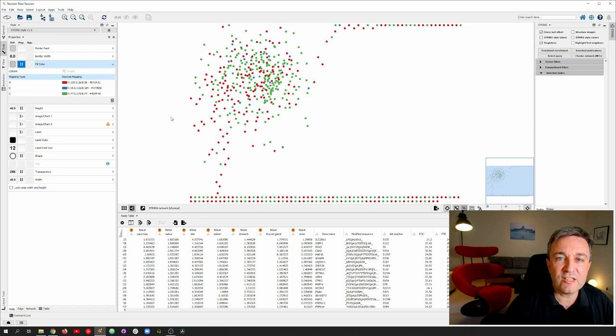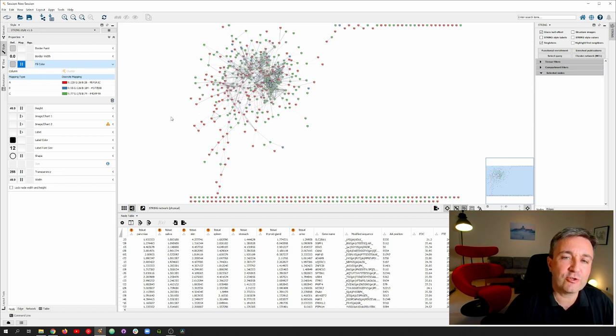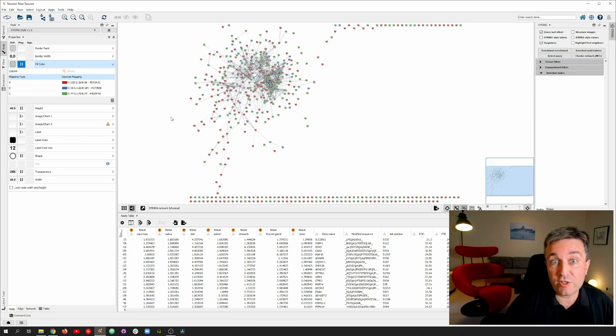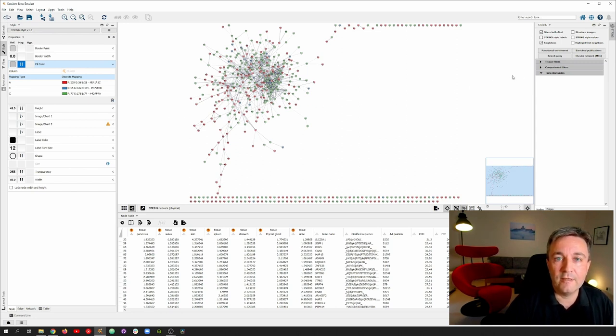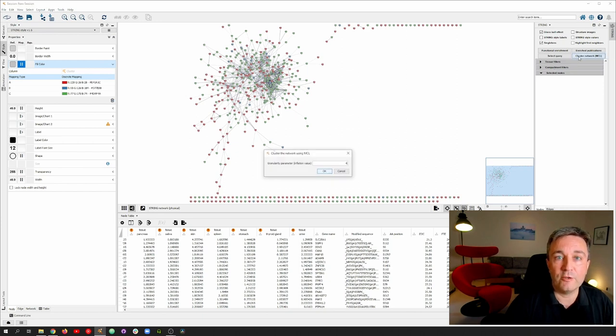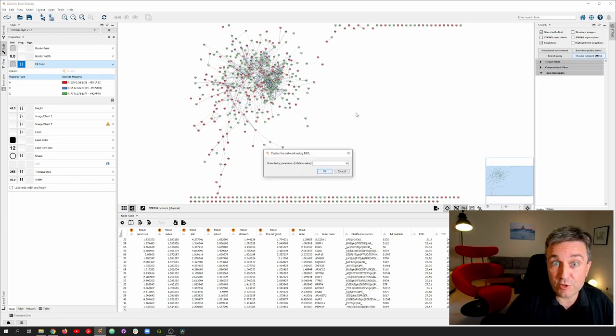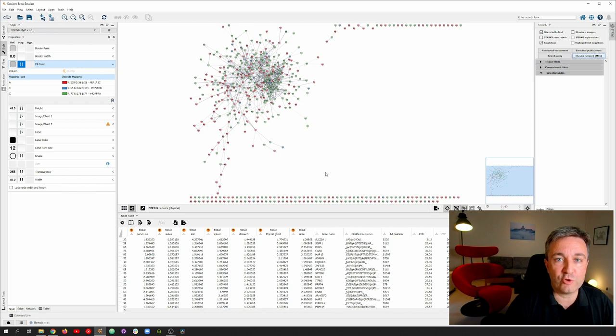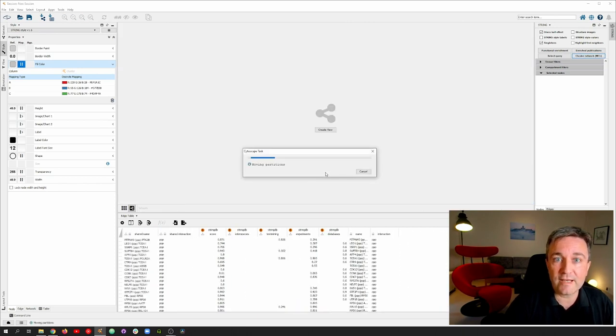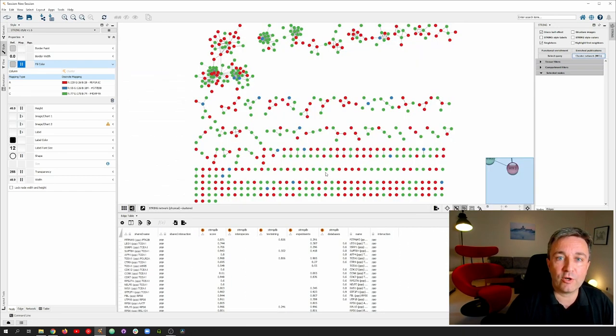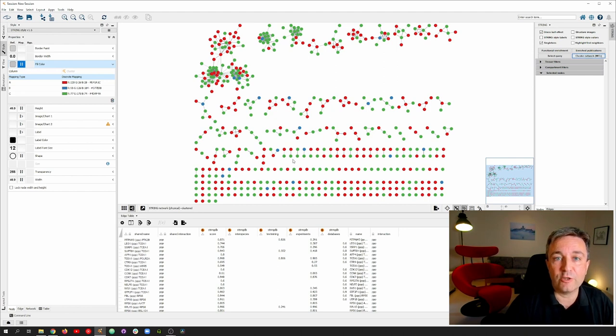However, it's still not a good visualization of the data set because the network is frankly a hairball. The solution to this is to run clustering on the network. From the string app panel, you can run MCL clustering, which is actually performed by the ClusterMaker 2 app. And once you do that, you get a new network where the big hairball has been cut up into dense clusters.